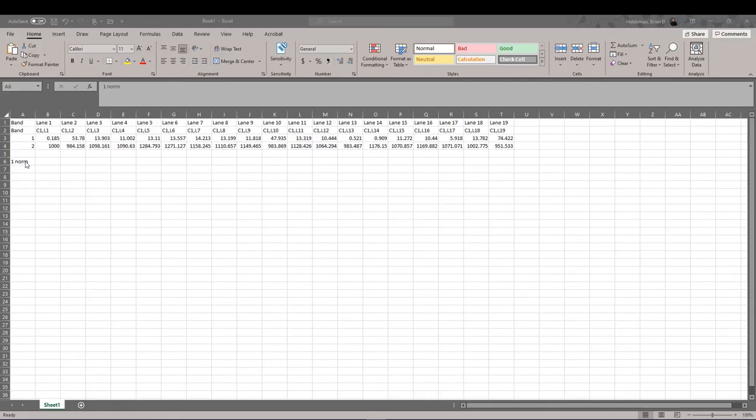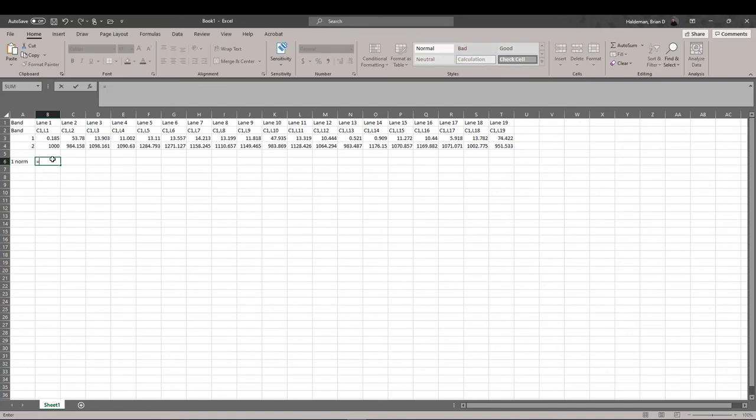Now that we have exported our data to Excel, we now need to normalize our bands of interest for each one of our lanes. We can do so by taking the unnormalized value and multiplying that by our loading control value, which is 1000, divided by the loading control value for that specific lane.